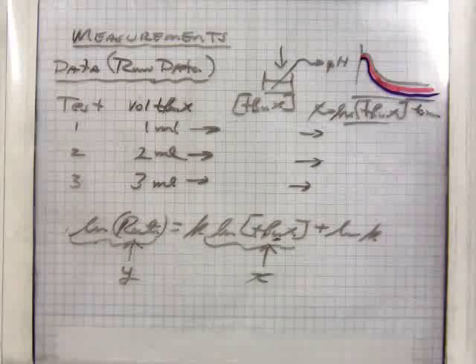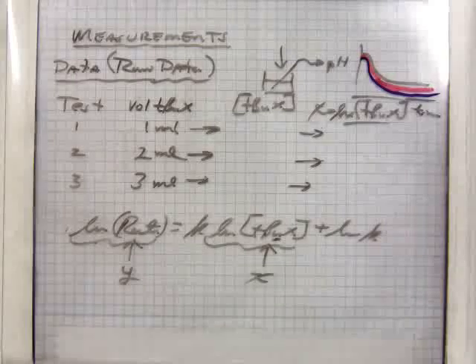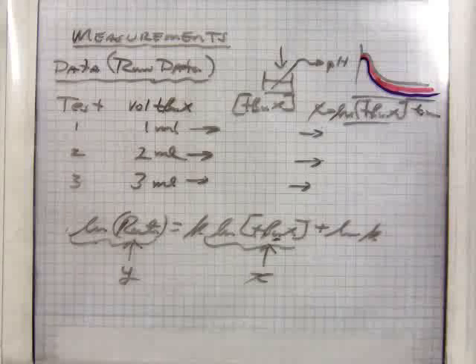Now, to calculate, change pH into hydronium ions, and hydronium ions is the T-butyl halide consumption, is 10 to the minus pH. Right here. When you download this, use this as a model. Because see, you're going to generate the curve and pick a time. Actually, you pick 3 times. Pick a time. This just shows 1. Pick a time. And you'll have 3 pH values.